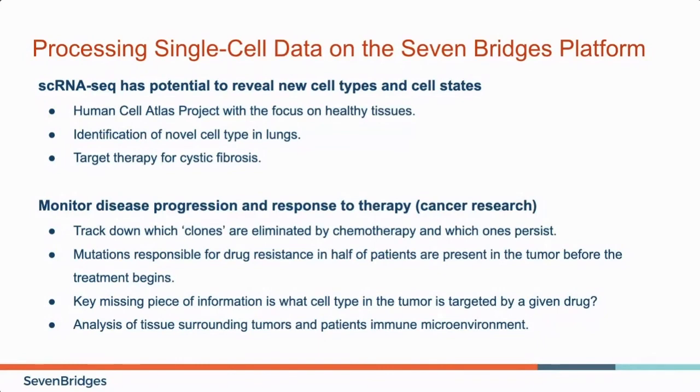Also, single-cell transcriptomics gives potential for mapping patients to the right cancer treatment. And additionally, how well a drug works also depends on what is happening in the surrounding tissue. Single-cell analysis of tumor environments provides a complete picture of disease progression and patient's response to treatment. And we showed a segment of such analysis in our presentation today.